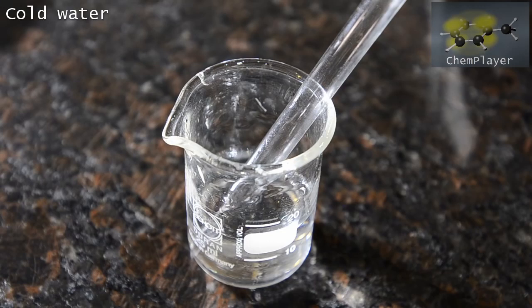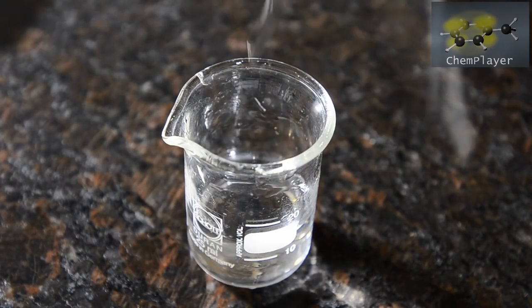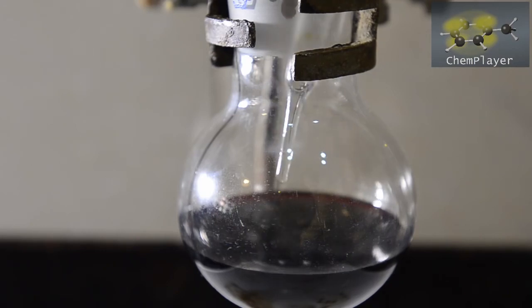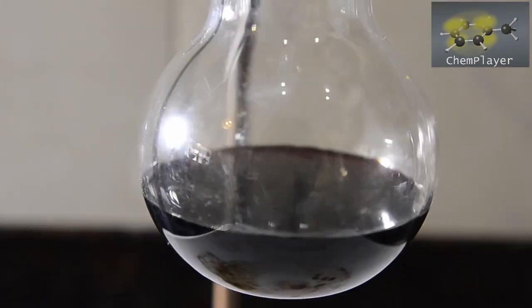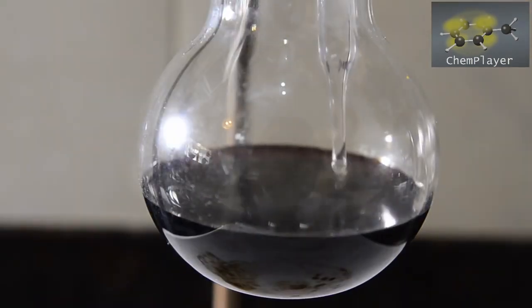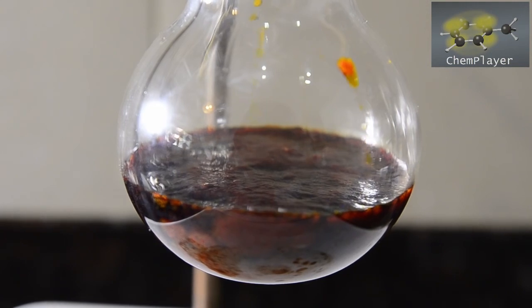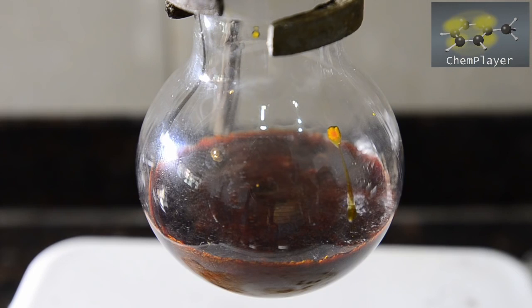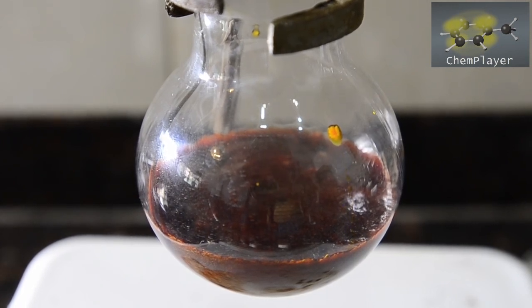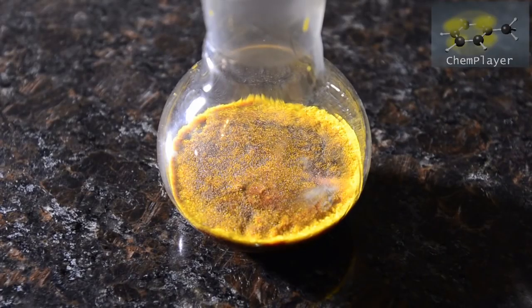We prepared a little cold water in a small beaker with a pipette, and we added this dropwise to the warm reaction mixture as it was cooling. After about 1 ml of water was added, the mixture started to crystallize and solidify. At this point we then placed it into the fridge and chilled it down for a few hours in order to ensure complete crystallization. Here's our chilled crystallized reaction mixture.